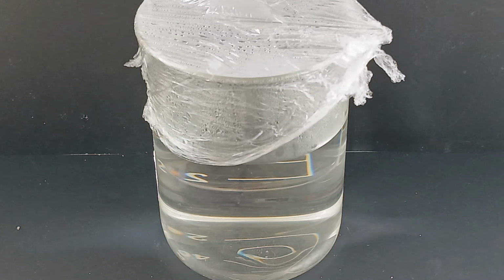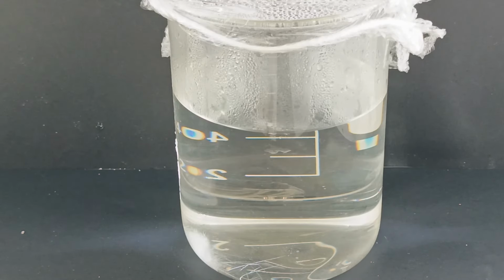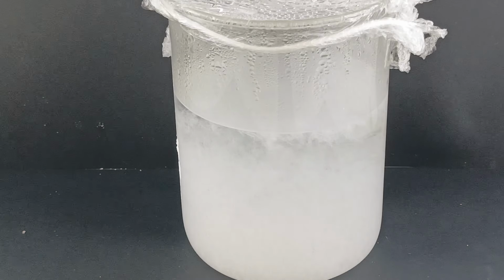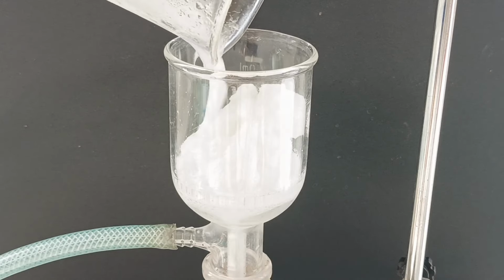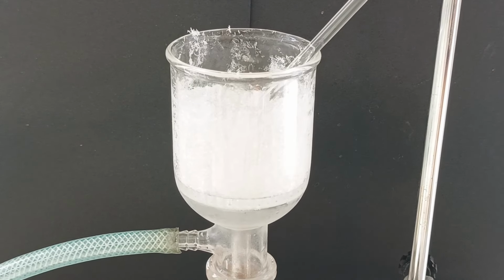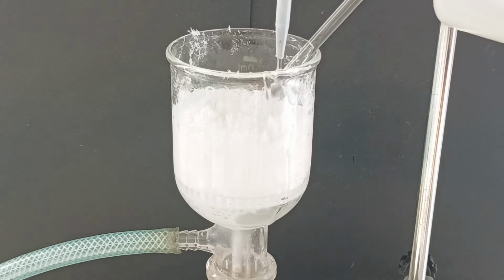Once the 30 minutes are up, I pour everything into a beaker and cover the top with some plastic wrap. As you can see, as it cools down, salicylic acid crystals slowly form. Once the mixture got to room temperature, I left it in the fridge overnight to fully crystallize out the salicylic acid. In the morning, I vacuum filter off the crystals and wash them with some water to get rid of all the acetic acid. Once I washed them a few times, I let them dry in the vacuum.